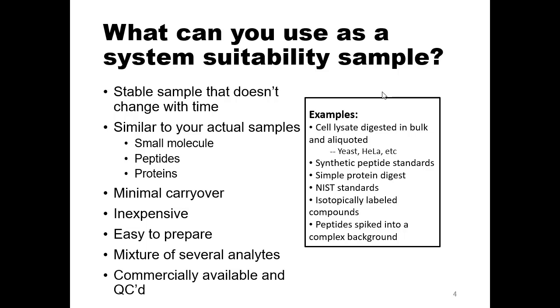This is an extremely similar type of method to that. It just takes a little getting used to seeing the plots. And I think now you can see all the chromatograms too. Did anybody figure out how to see the chromatograms in Panorama Web for AutoQC? You can check the chromatograms too, if you're interested in shape specifics.